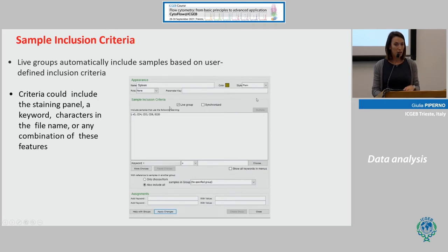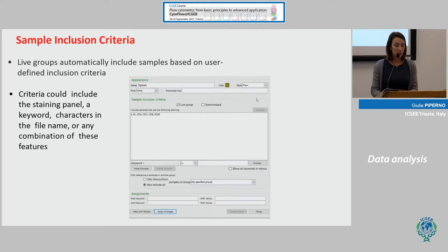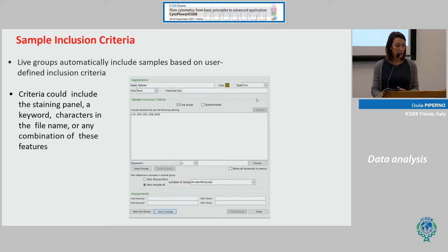Groups are also called 'live groups' because you can include criteria for your samples. For example, these samples were analyzed using different colors: live/dead, CD4, CD3, CD8, and B220. This criteria can include the staining panel and also different keywords that you can add.